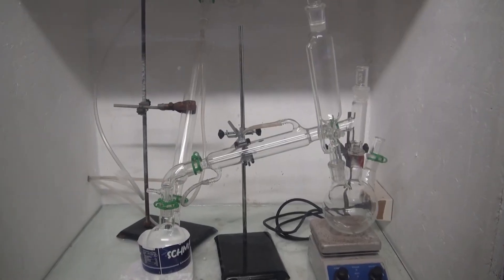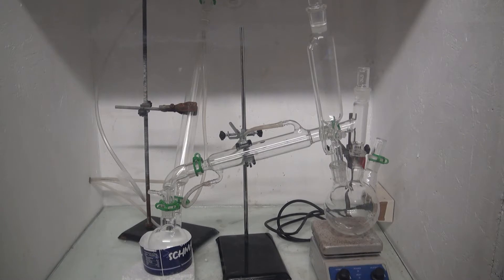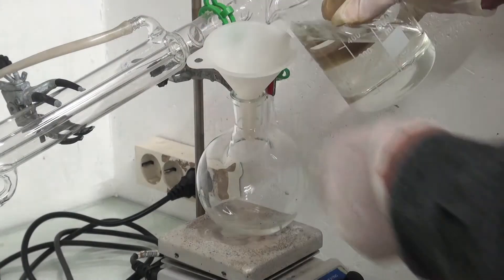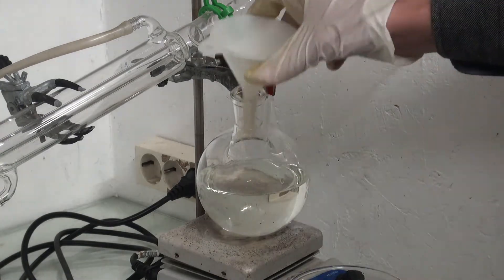Next I set up a simple distillation apparatus with a reflux condenser at the end to catch as much bromine as possible. I added in the hydrobromic acid and then manganese dioxide as my oxidizer.